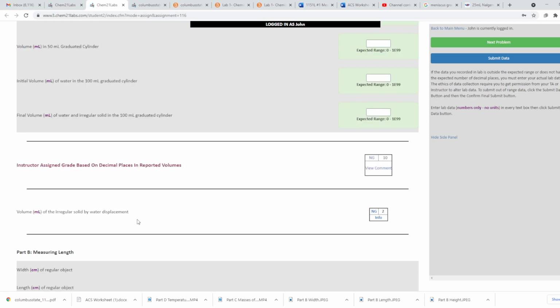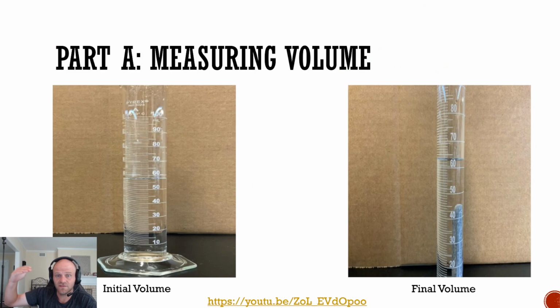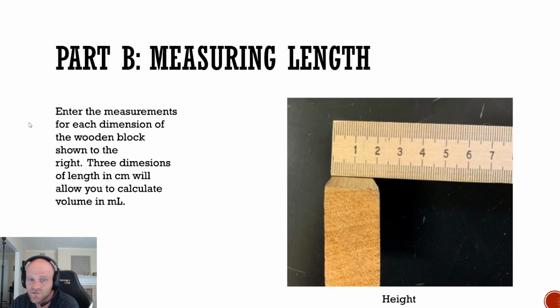So make sure that you have estimated digits as possible, right? That you're as precise as possible, and then that way you'll have as many significant figures as you need to calculate in the end, right? If I do 25.0 minus 20.0, that'll be 5.0, right? So I only got two significant figures in the end there, but adding that point zero for both of the first values allowed me to have that extra significant figure at the end. All right. Let's keep going. So that covers part A.